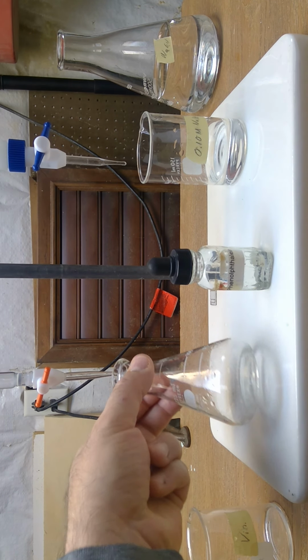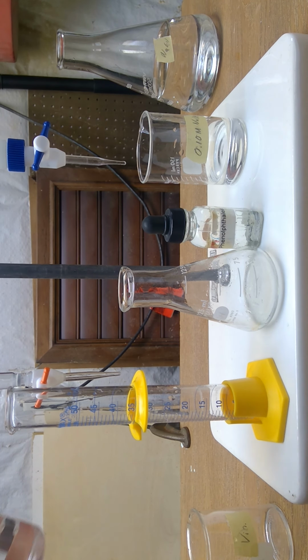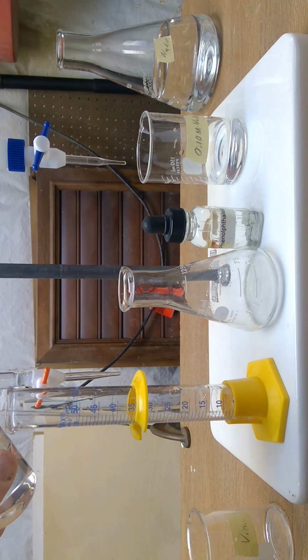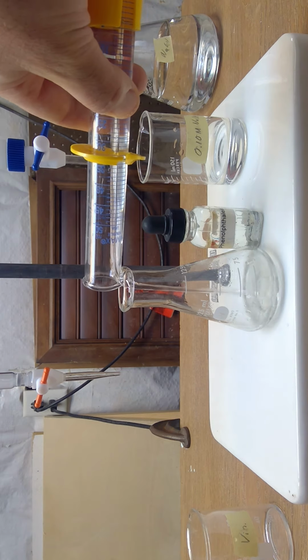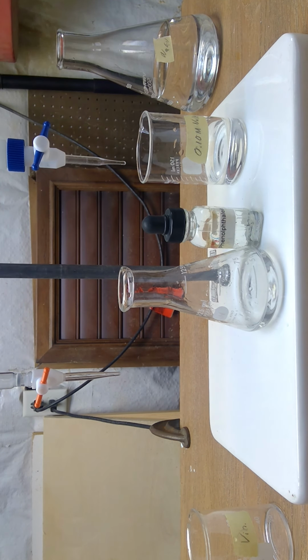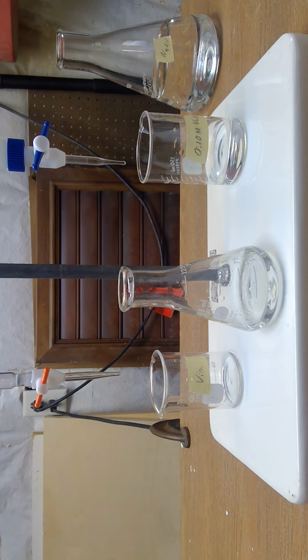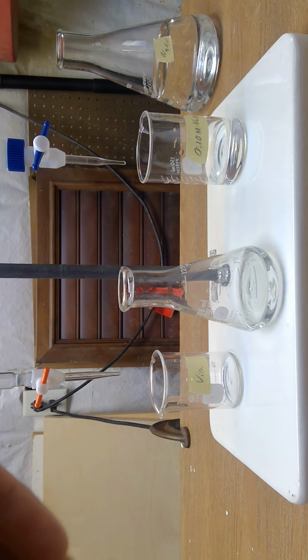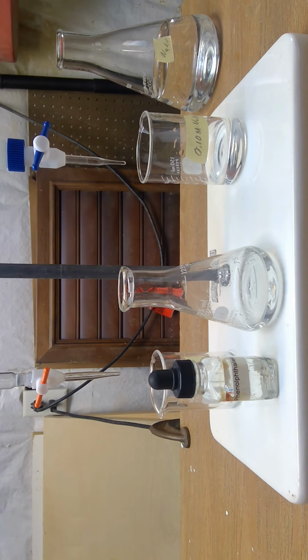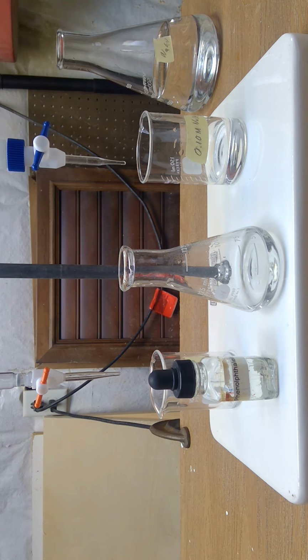Well, that's good. I have to add about 20 milliliters of water. And we can't forget to add the phenolphthalein. Every year I have this happen. Someone will call me over during a lab and they'll say, we've added 50 milliliters of base to this and it hasn't changed. Something's wrong. And I'll say, did you add your phenolphthalein? And they'll say, oh yeah, I put my phenolphthalein in there. And I'll put 1 drop and it'll turn this deep magenta color.